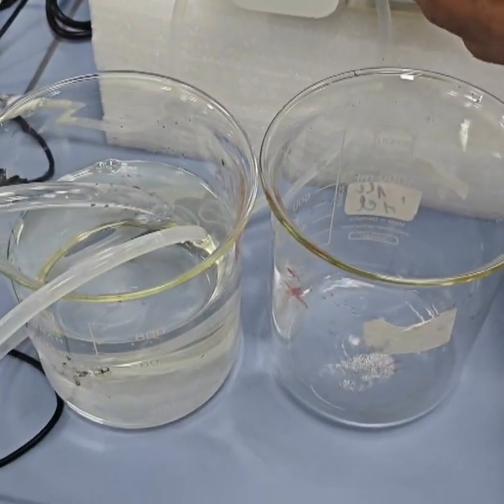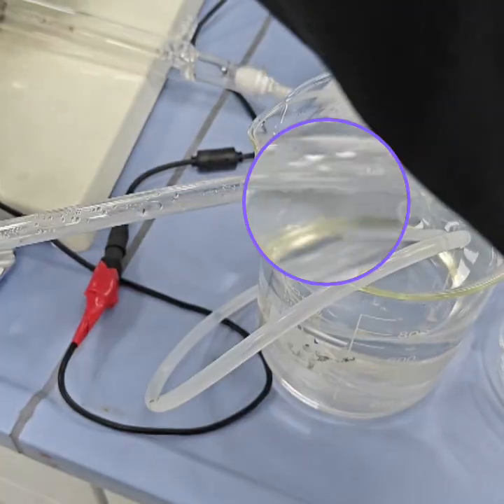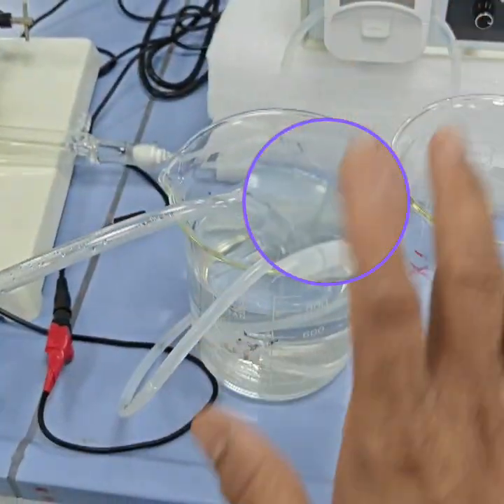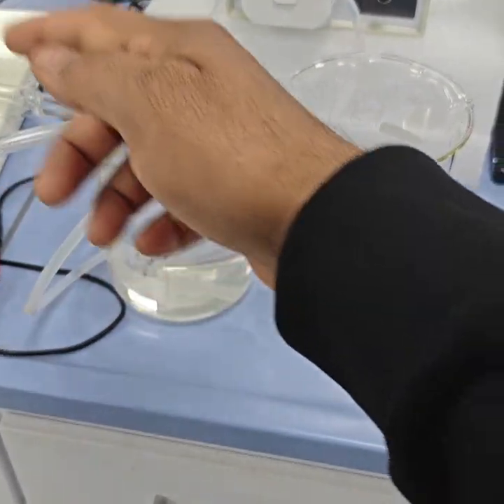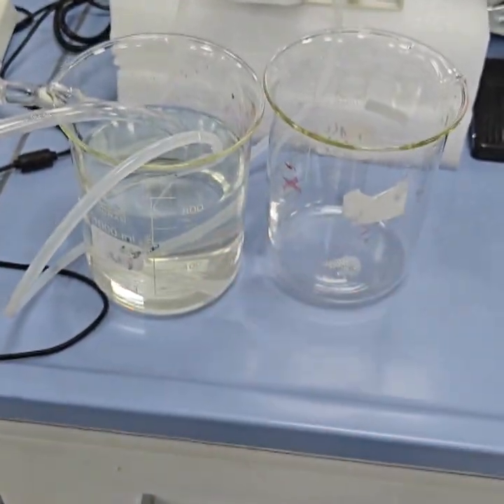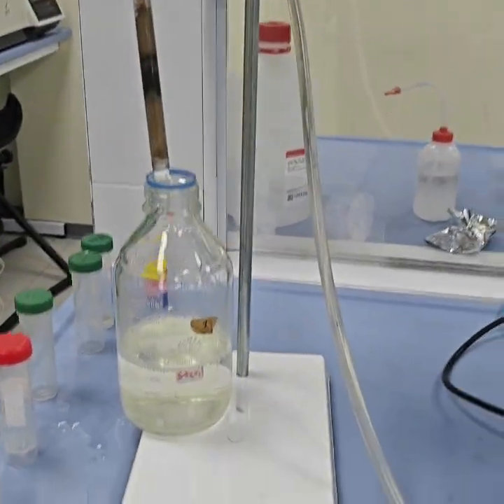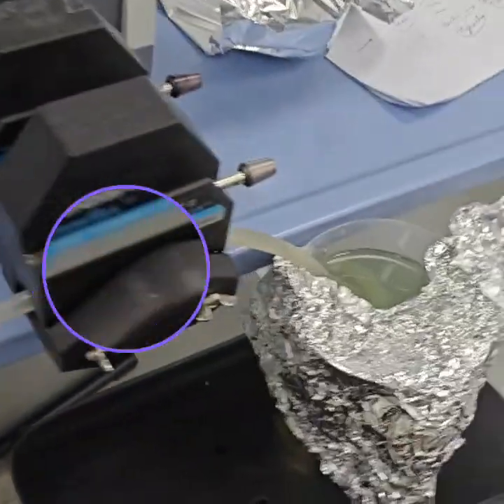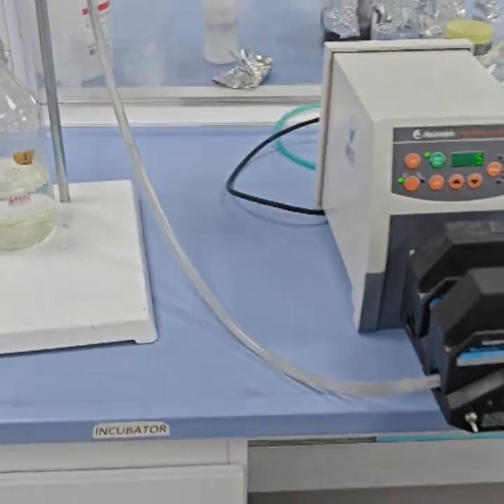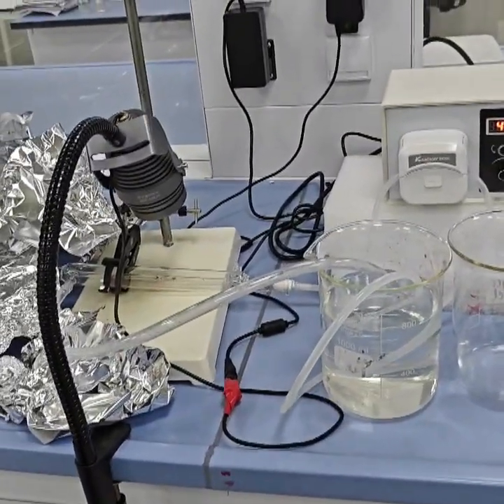You can see the water is now going, and then it will slowly come out of the system. So it's like a continuous system. Whatever reactant is going goes back into the system, so that you can achieve 100% removal within a certain period of time. It's not like a batch process, where the water flows here, is collected, and we usually discard it and don't put it back. So that is not a continuous system, and this is my continuous system, which we have designed in the laboratory for our experimental purpose.